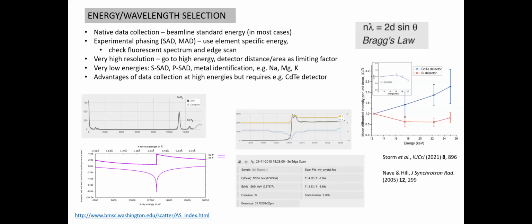And then usually for MAD, there's also a high energy remote. And in some cases, people have also collected a low energy wavelength. And there are other different schemes in the literature. I don't have the time to go into detail.